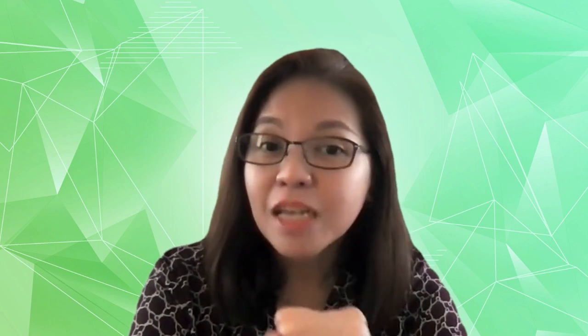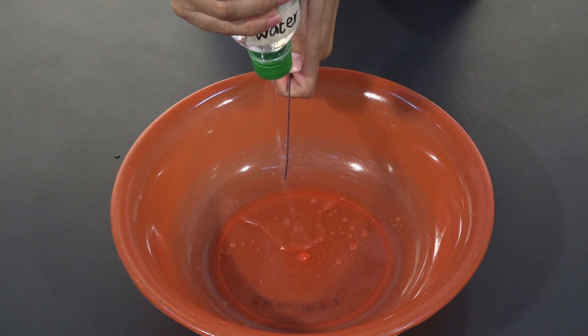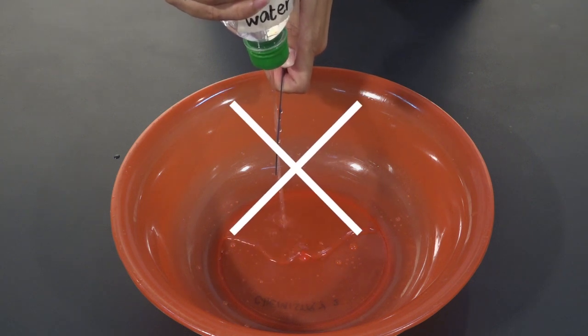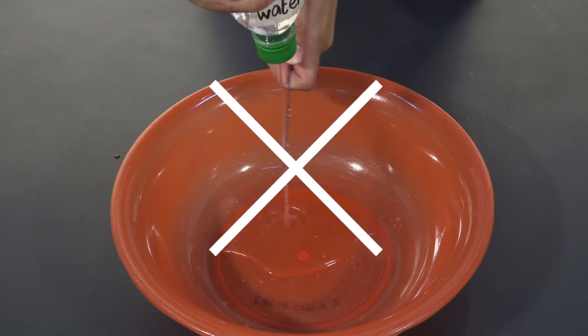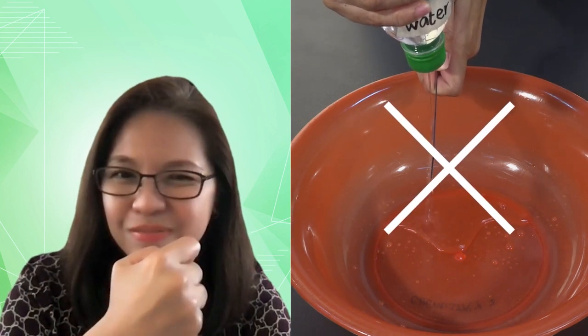A word of caution. Yes, you have to bring that rubbed area of the plastic ruler near the fine stream of water, but make sure that the plastic ruler never touches that fine stream of water as it flows down from the bottle. And that holds true for any of our 4 liquid samples. Now, if that happens, oh no. So, let's continue doing this properly.